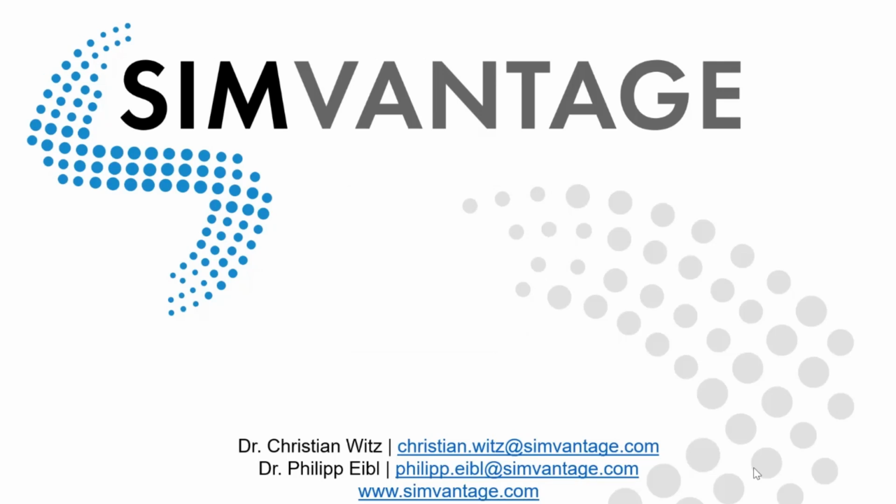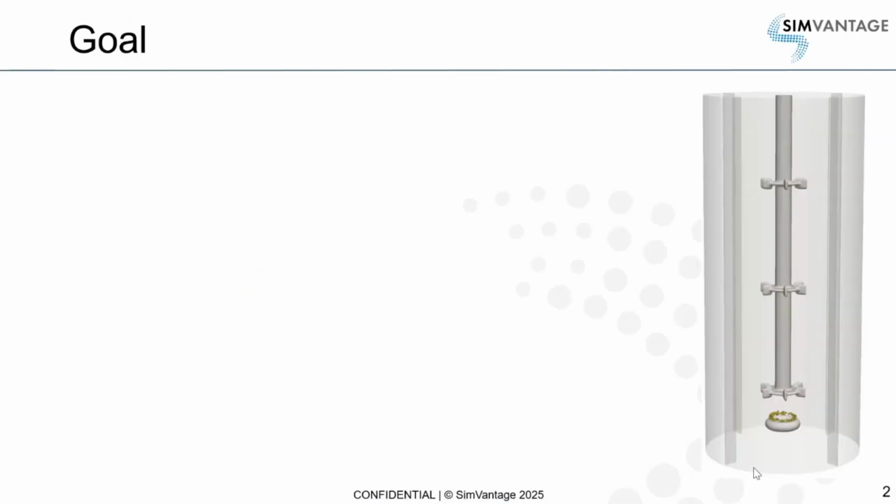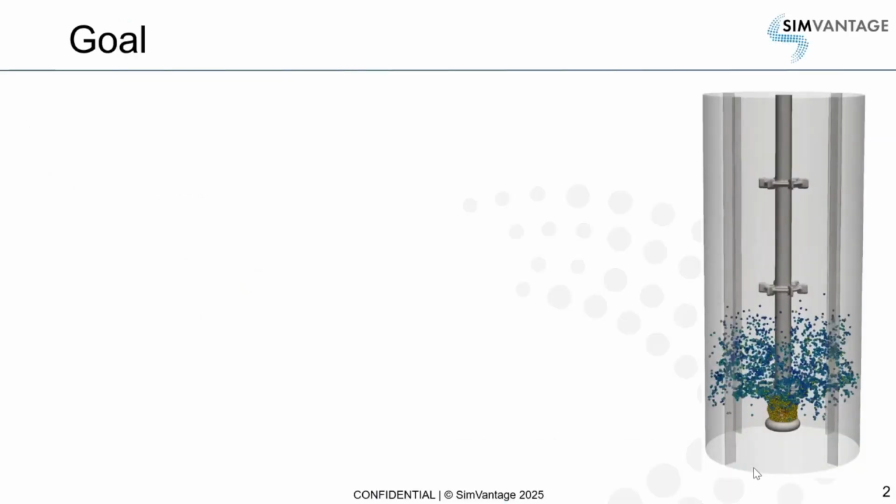So hello, my name is Witz. I'm from the company Simvantage. We're based in Graz in Austria, and today's topic is the use of computer simulation in the scale-up or characterization of bioreactors. Let's dive in.